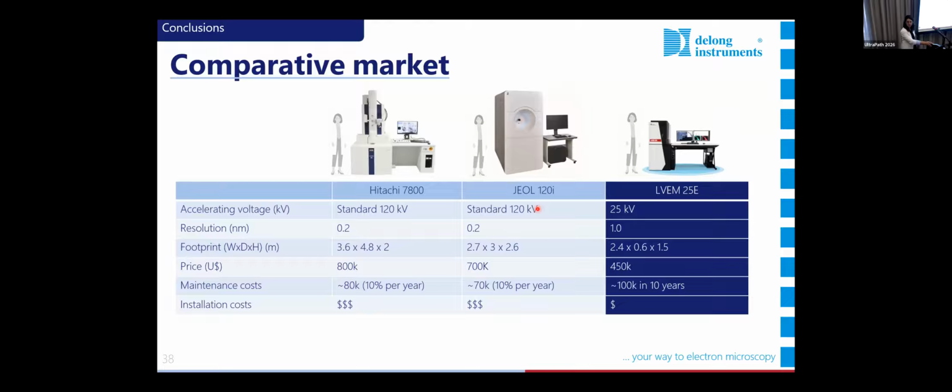David. Yeah, very interesting talk. We had a nice talk yesterday from Rucheng Shah about environmentally friendly laboratories. One of the points she made is that pieces of laboratory apparatus use a lot of electricity. A minus 80 freezer sucks a lot of electricity, and electricity is in short supply now. So I would imagine that a relatively high voltage electron microscope uses a lot of energy, and your instrument probably uses less. Have you ever tried to do a comparison to see how much energy?